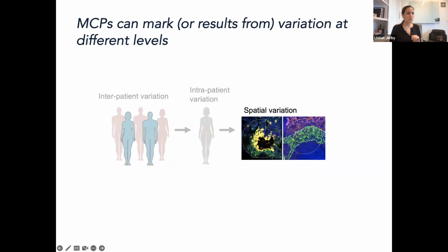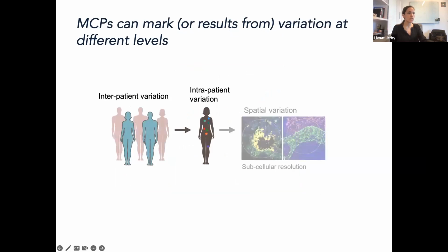Okay, so far we talked about spatial variation, and there's a lot that we can learn from spatial data, and the statistical power, of course, is much greater than looking across different individuals. But in fact, there are many different types of variation that can be extremely meaningful, especially when we're thinking of studying diseases.